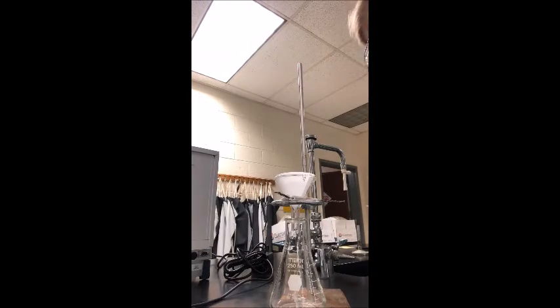This process is very time consuming. It takes a long time to do this. So I'm just going to keep adding. And then when I get to the precipitate layer at the bottom and I have to swirl, I'm going to show you that step. So right now it's really just filtering most of the liquid. A little bit of residue from the liquid will stay on the filter paper, but for the most part, we're just getting rid of the filtrate, or the liquid part, and we're going to keep the precipitate on the filter paper.